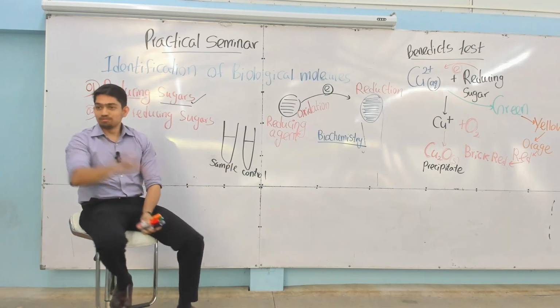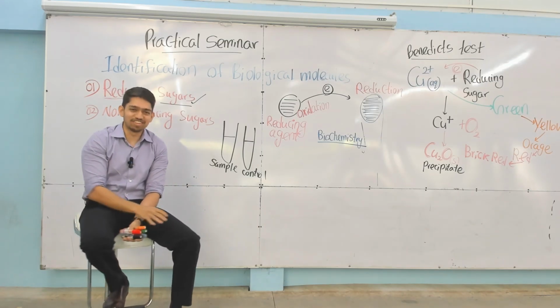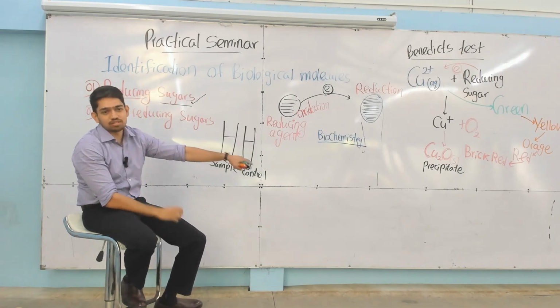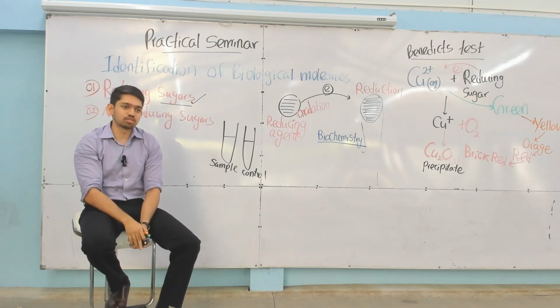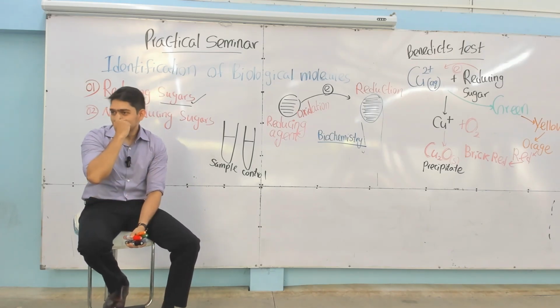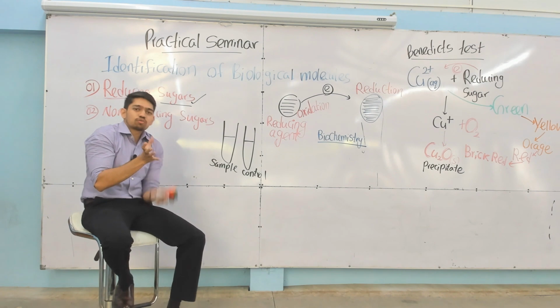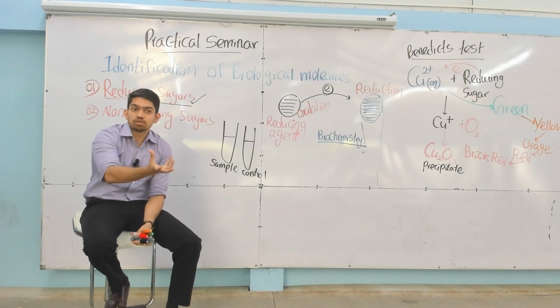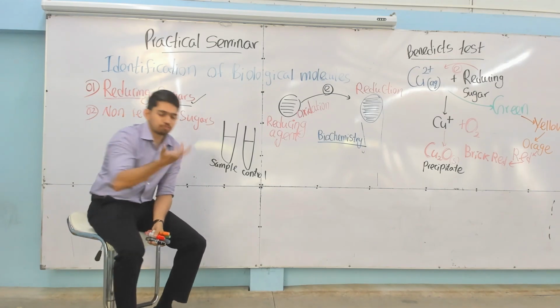So control, or a randomly chosen diabetic patient for the positive, right? No, that's not enough. Usually there's also not enough urine to be used for the sample, even from diabetic patients in Kalubovila hospital. So what they do is artificially add some glucose or some protein from outside so that we can get a positive result. Okay. So that's what an applied experiment is like, when you apply the theory in a real life situation to see if a person is diabetic or not. That's the real life application that we are preparing you for.